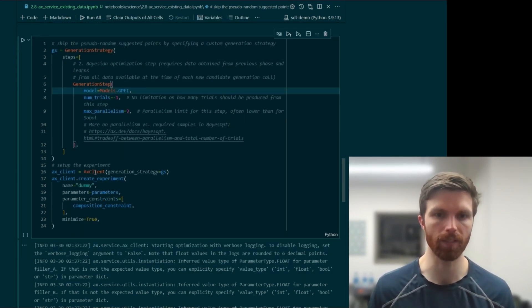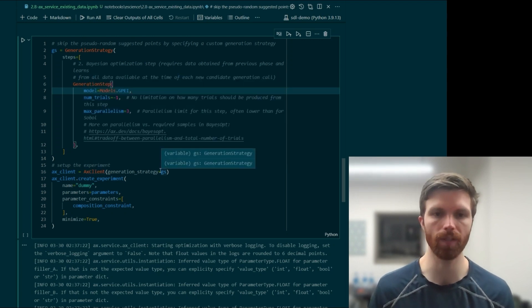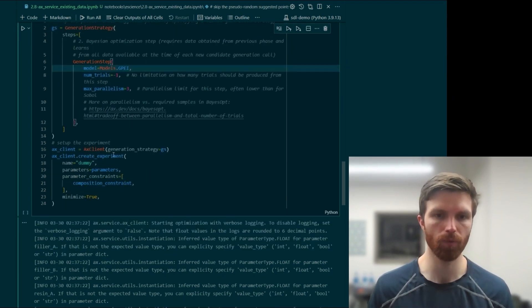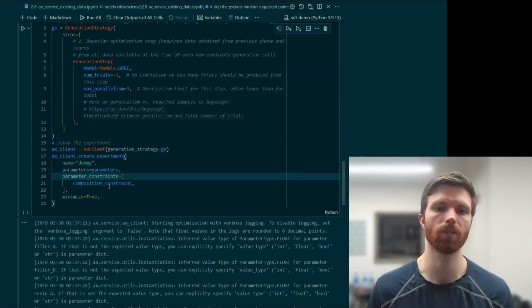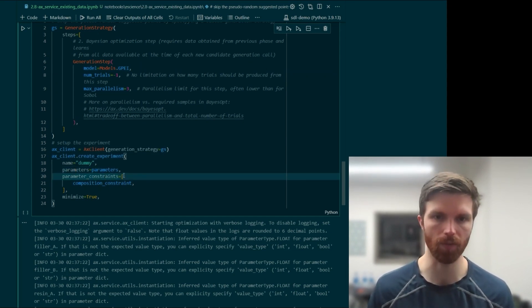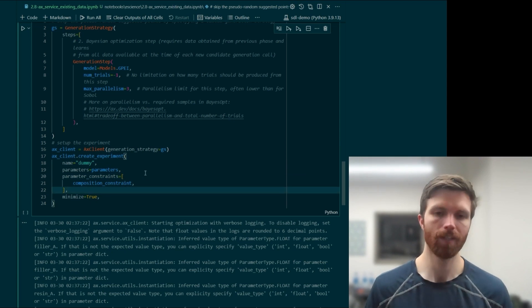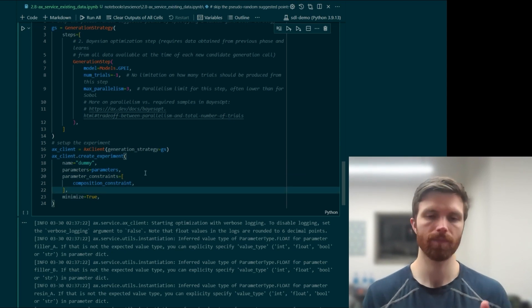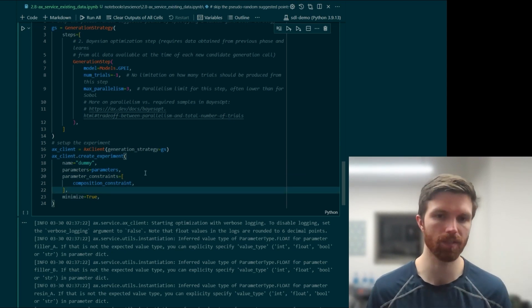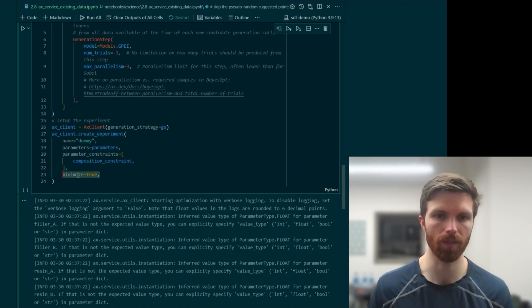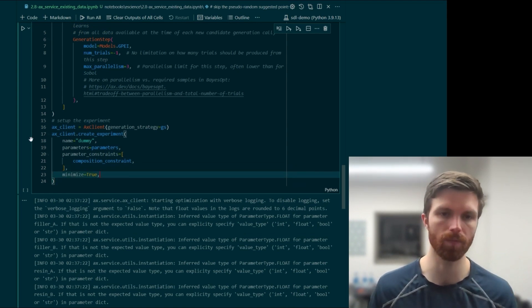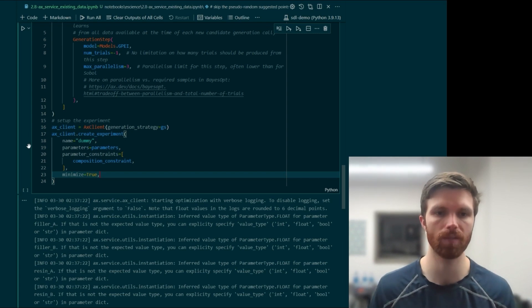Then we instantiate our Ax client with this generation strategy, create our experiment, and we'll pass in our parameters as well as our parameter constraints, which is just a list of our single constraint wrapped in a list here. And we'll say that we want to minimize the dummy objective values that we set up.